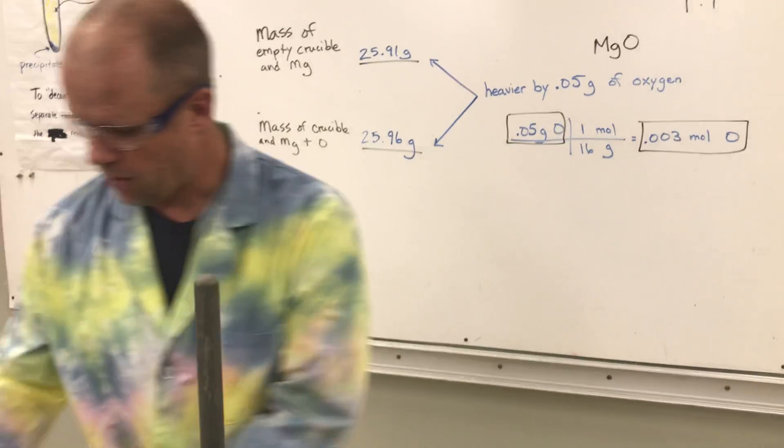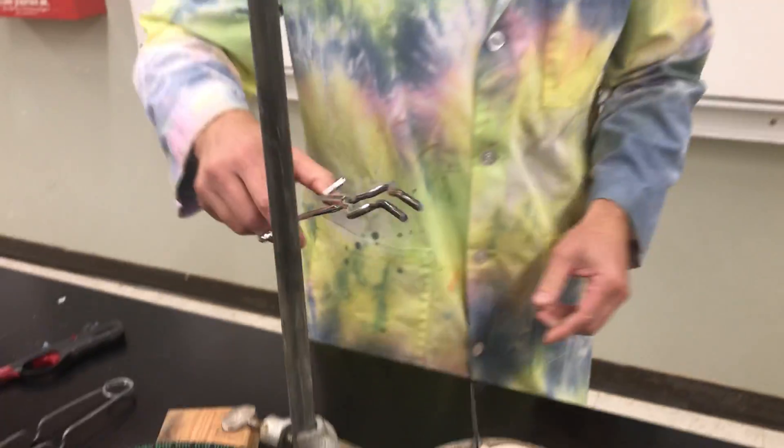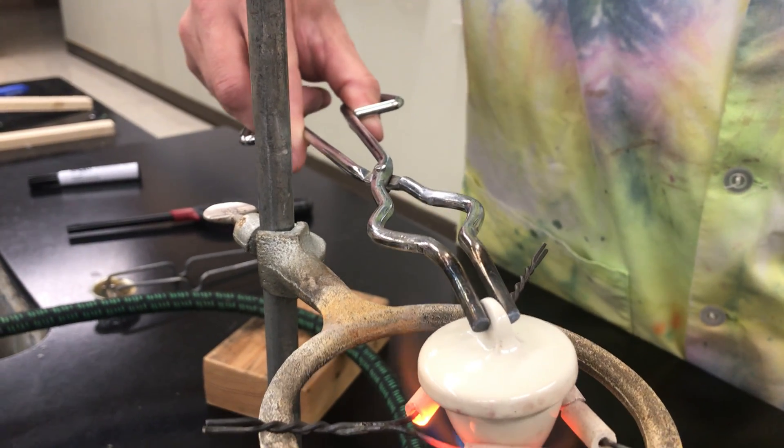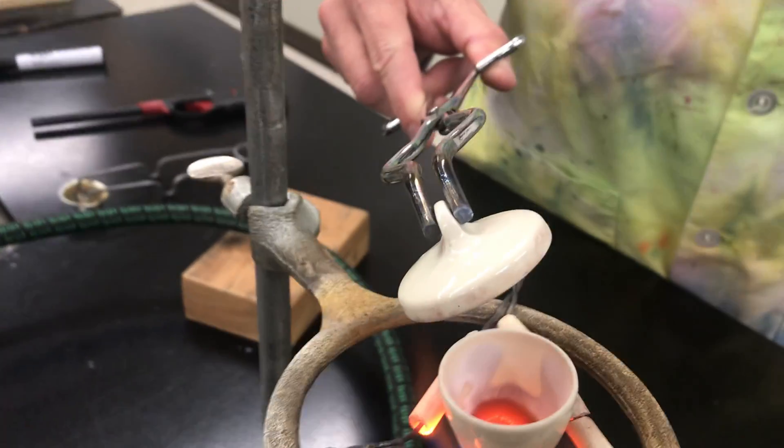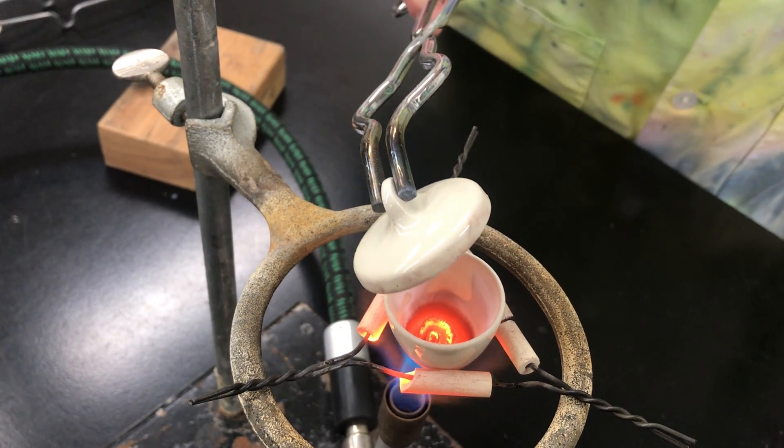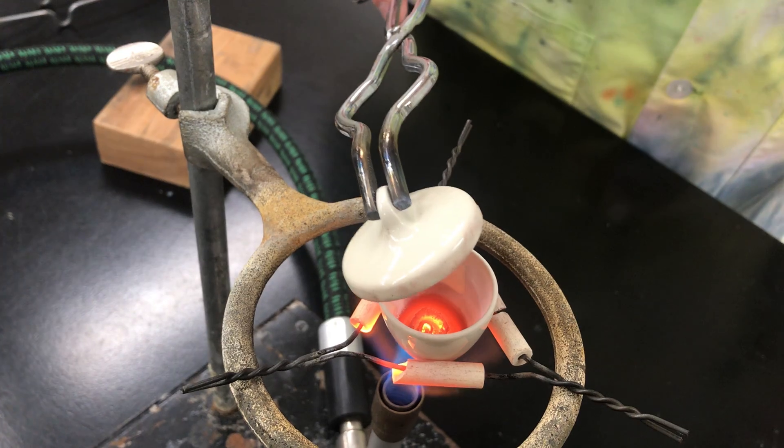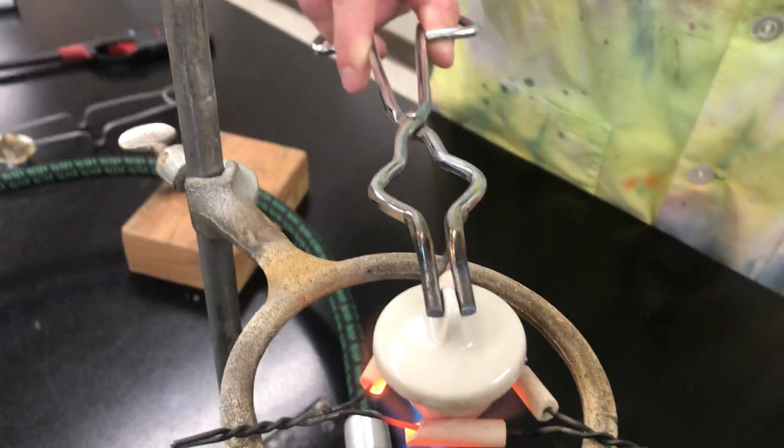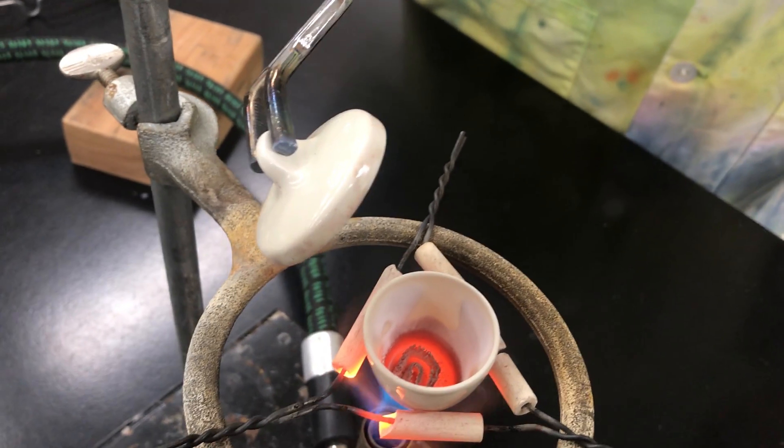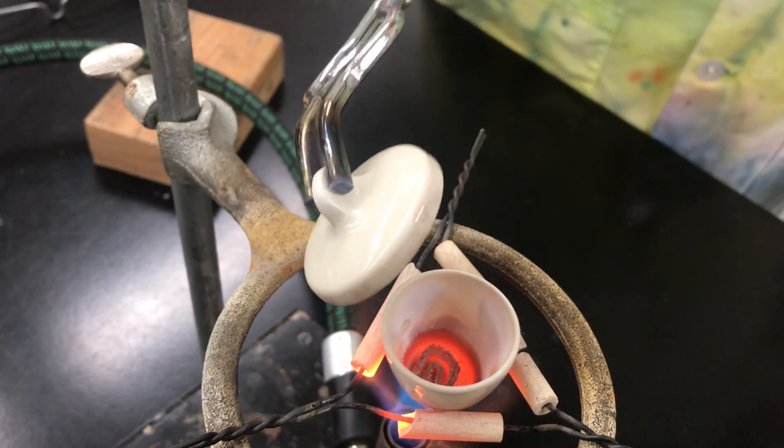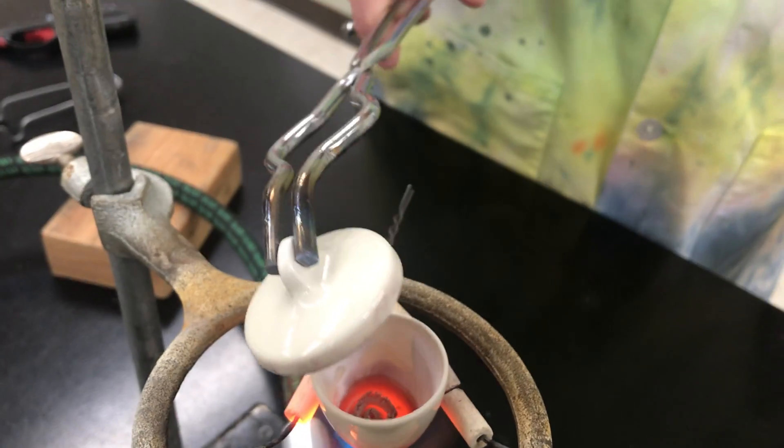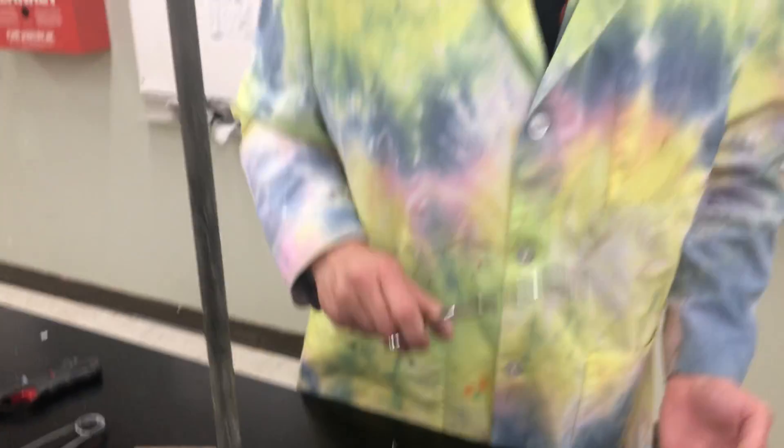Now, let's take a look at what this looks like while it's happening. I'm only going to lift this up for small amounts of time. Take a look inside, you see it start to glow. It's igniting, it's burning, it's burning a little bit slower because there's limited oxygen in here. And then I put the lid on and I capture that smoke so that it doesn't go away. And I keep doing that. And eventually, I just get this ash in there and I get a bunch of smoke built up on the bottom of that lid. And I'm going to weigh all of it together so that I didn't lose a bunch of smoke in the process.